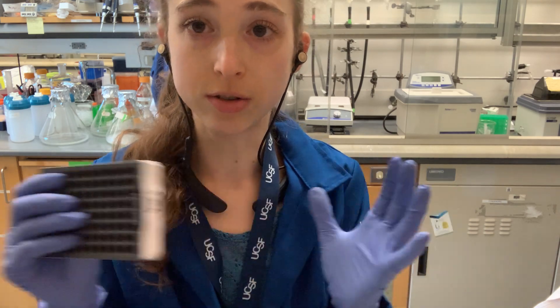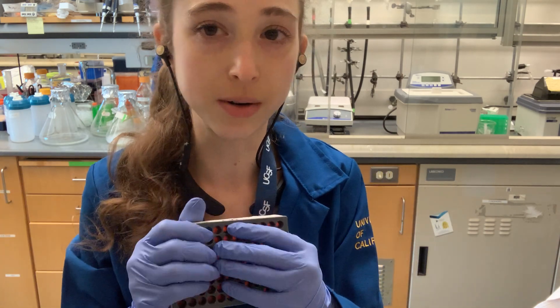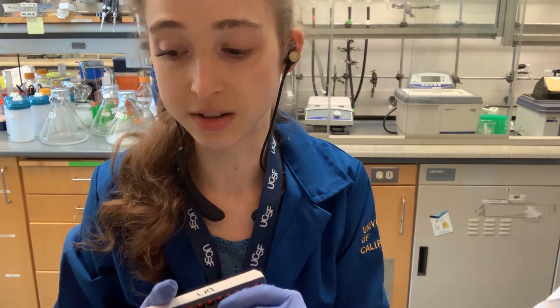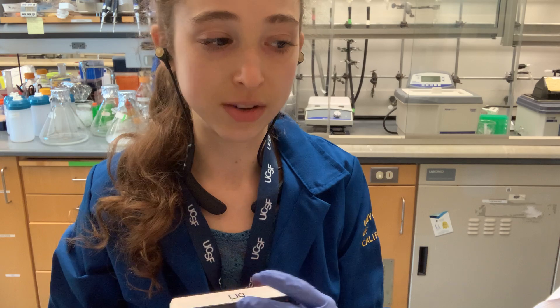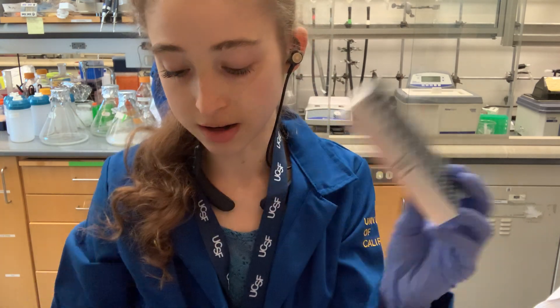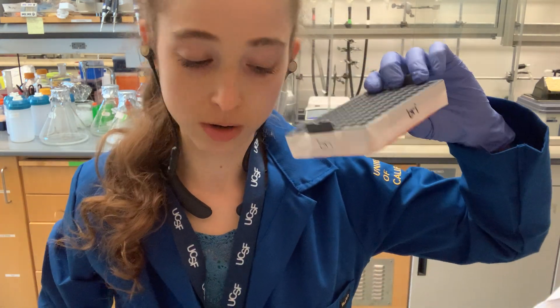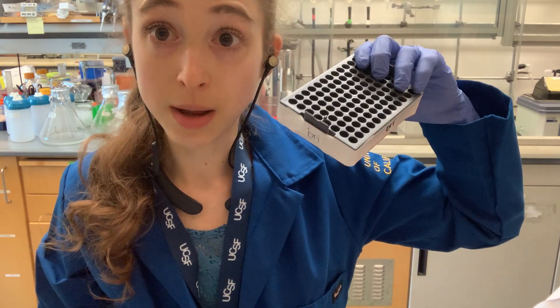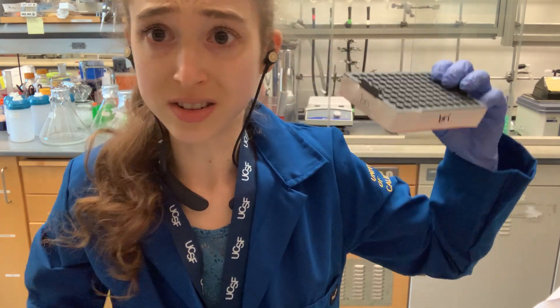These are really great if you're doing work with radioactivity or anything where contamination is a risk, because if you contaminate one of these it's not the end of the world — you just stick it in the radioactive waste and you don't have to worry about losing money. You're repurposing your tip rack holder. Happy pipetting — hope this helped!